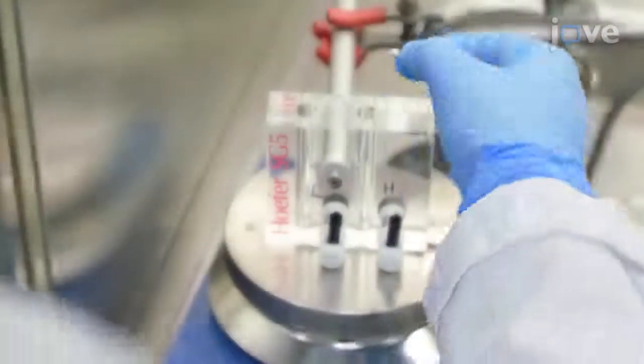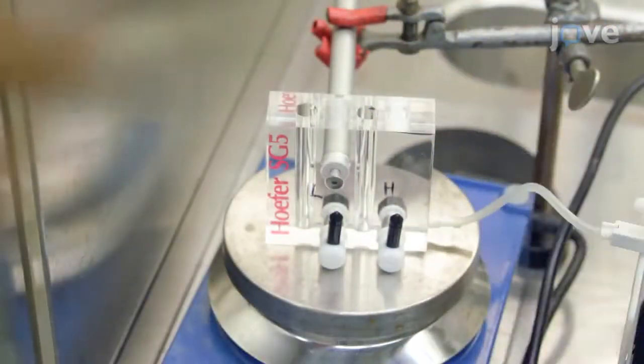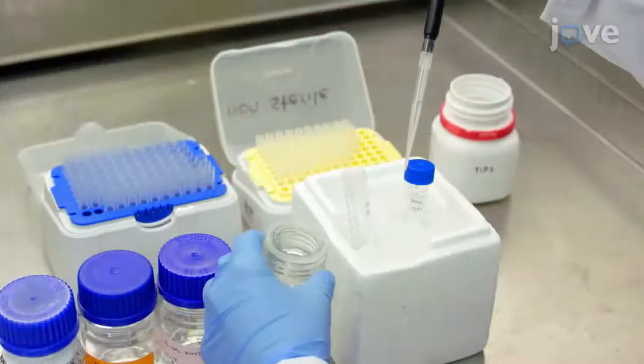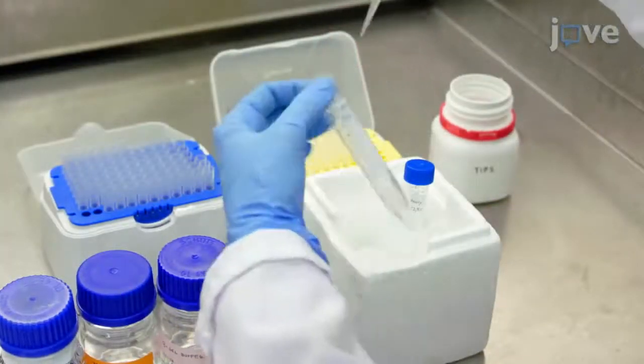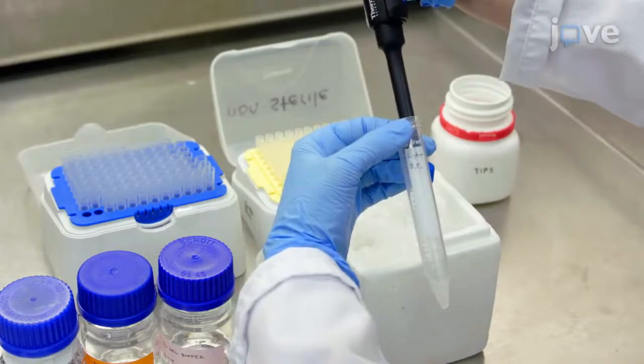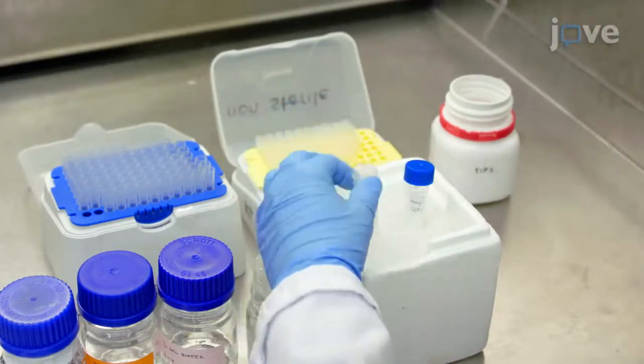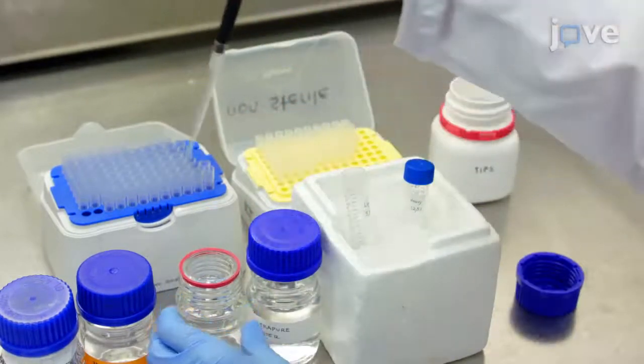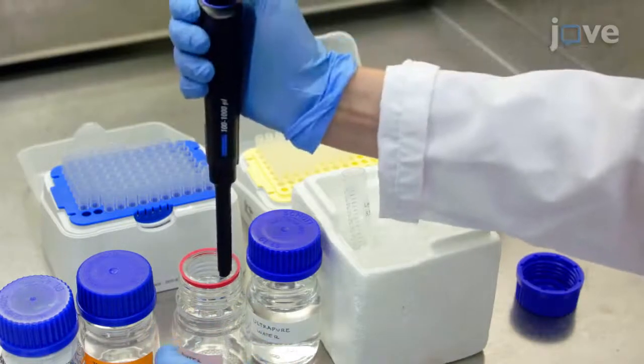Place a magnetic stirrer in the heavy chamber. Prepare 3.5% and 12.5% acrylamide solutions in 15 milliliter conical centrifuge tubes as detailed in the text protocol to use for the separation gel gradient.